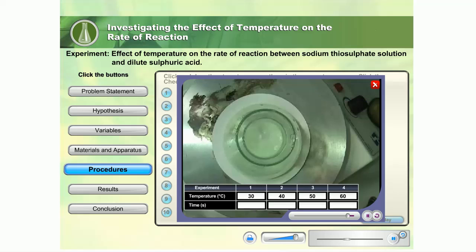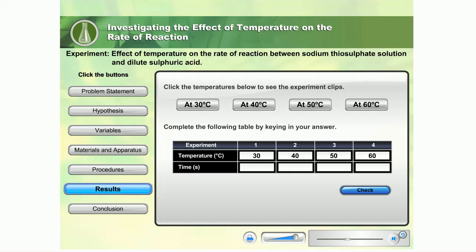Repeat the experiment using the same volume and concentration of both solutions at different temperatures as shown in the table. Record the time taken for the process at different temperatures. Key in the recorded time in the table provided.